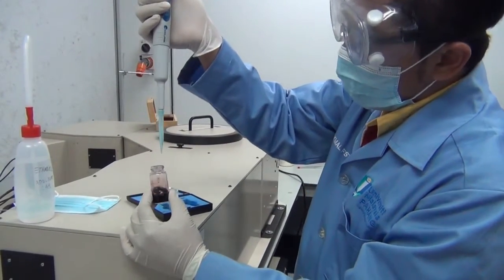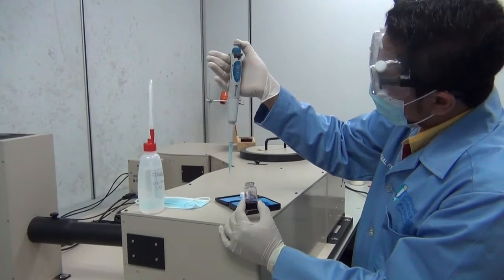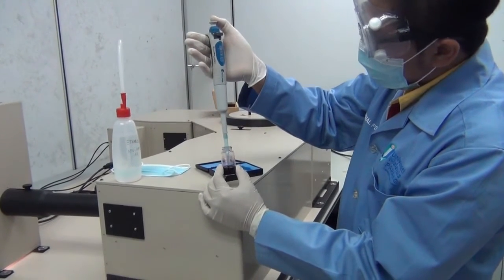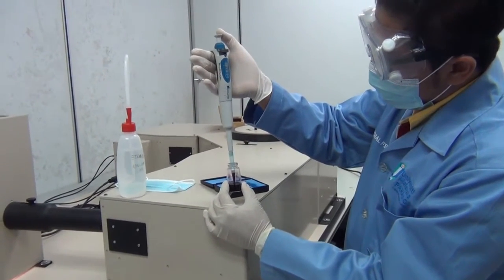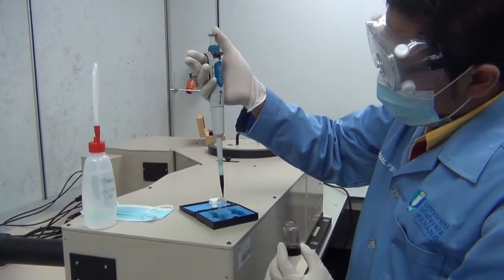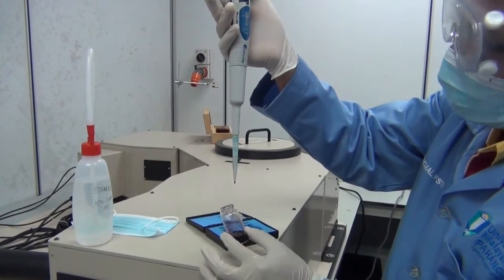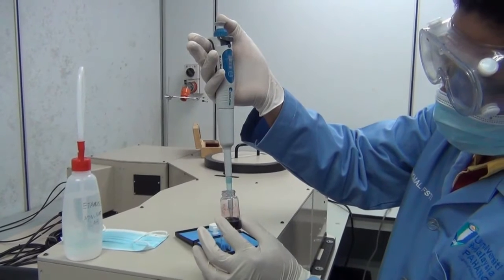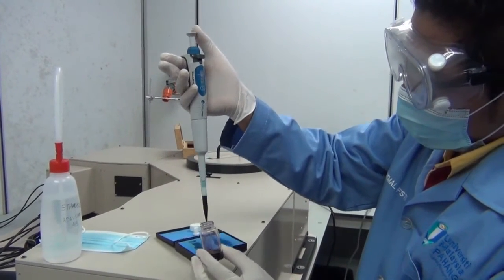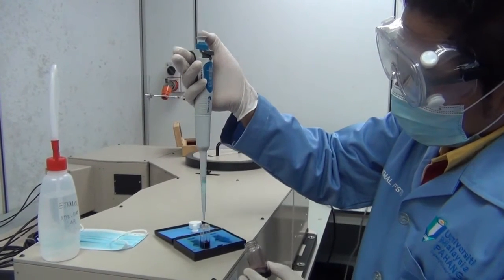Okay, this is how you press it. Press until here. Do not press too much. See the difference? Press until here, and release your thumb. It will suck all the liquid. Then press your thumb again, and without releasing your thumb, suck the liquid again. Slowly, do not make it too fast. Press your thumb again. This is not enough, you need to add some more.